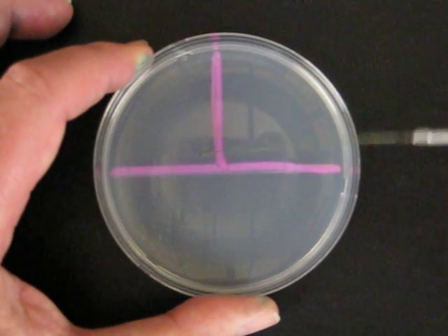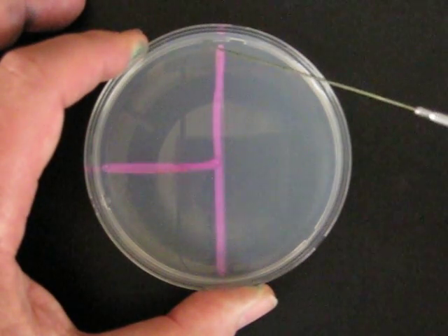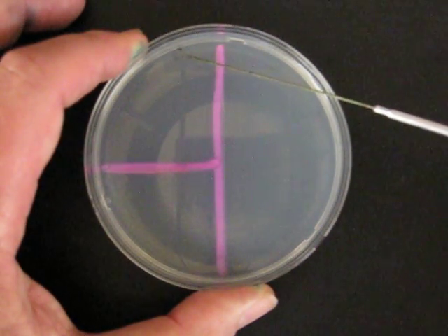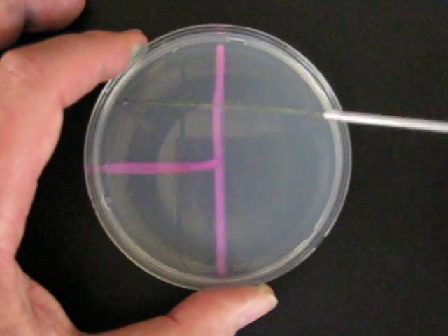For the final phase, the loop is flamed again and the plate is rotated another quarter turn. Picking up organisms from the second phase, the third phase is streaked.